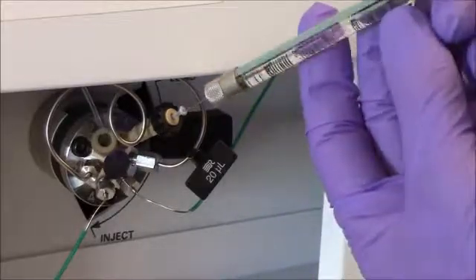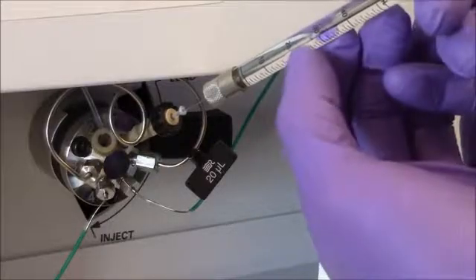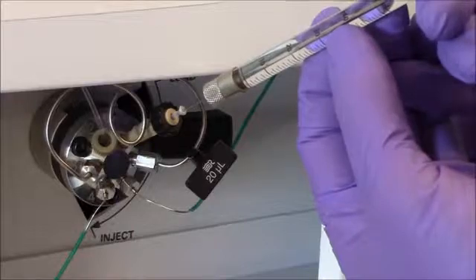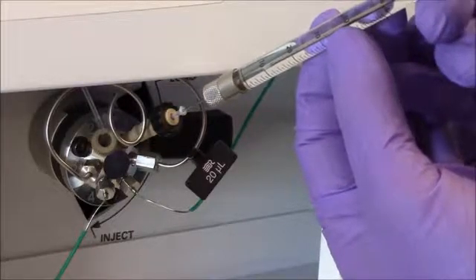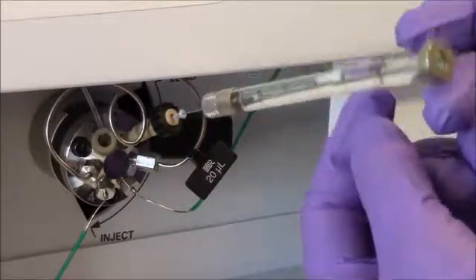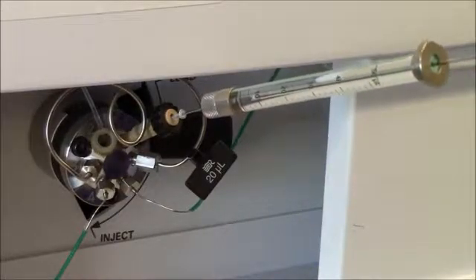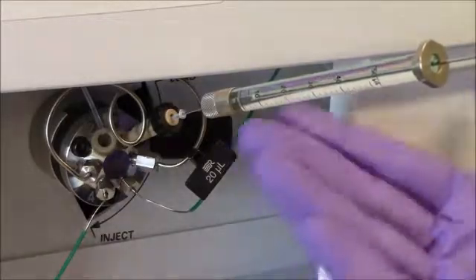And then I will inject not the entire 40 microliters, because there's a little air bubble here. Very common to get a little air bubble. And so I'll inject without putting the air bubble in there. So I need to put at least 20 microliters into the loop. So this is fine what I've done here. I'll leave the syringe hanging here. That's sort of a system I have of saying, I know I injected my sample because here's the syringe.